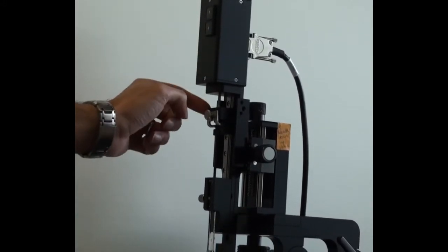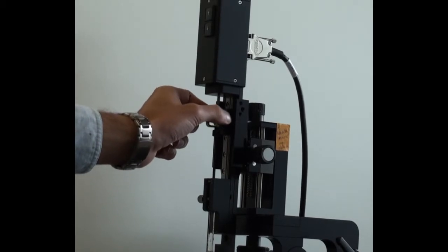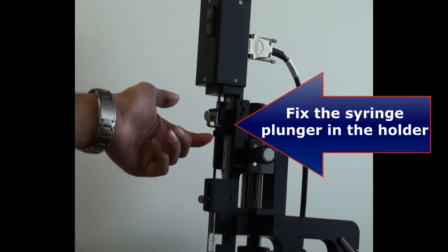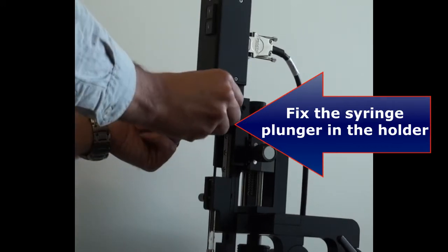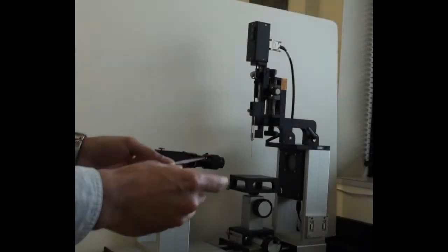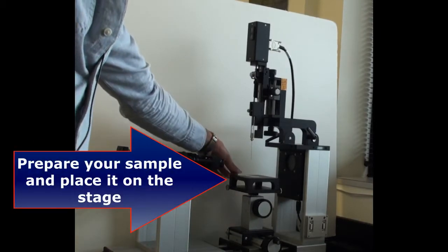Now that the plunger holding unit is in contact with the plunger, move the securing plate up and secure the plate, then locate it on top of the stage.